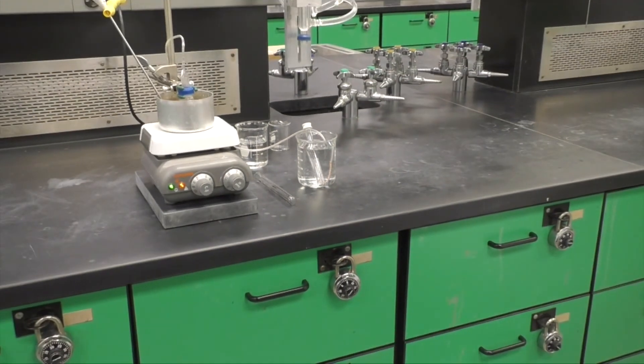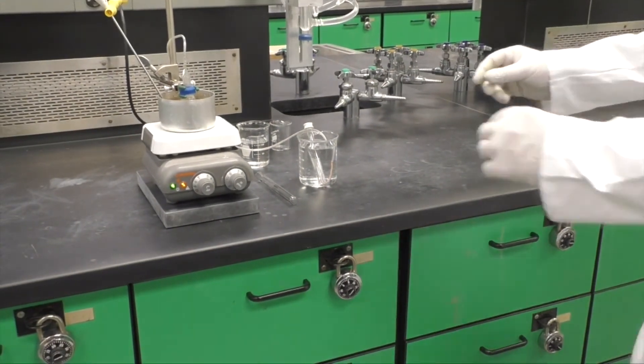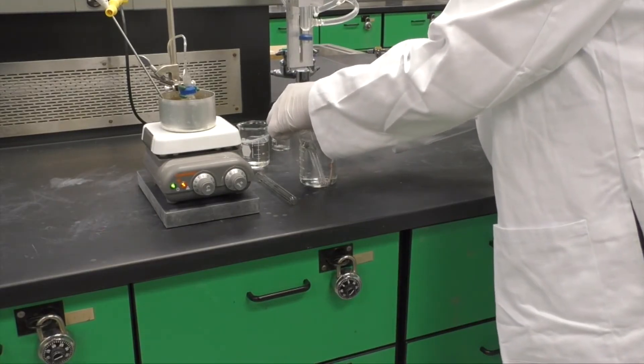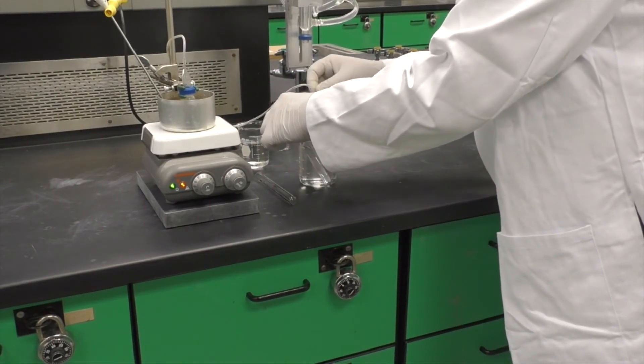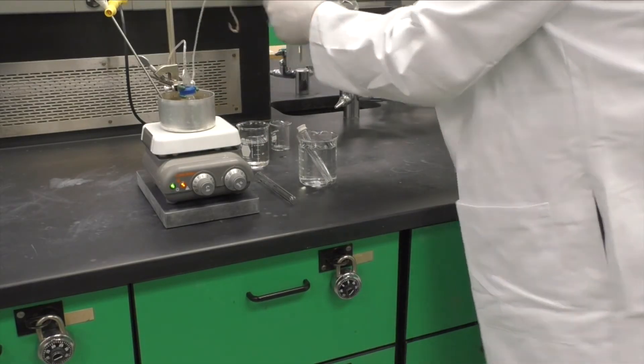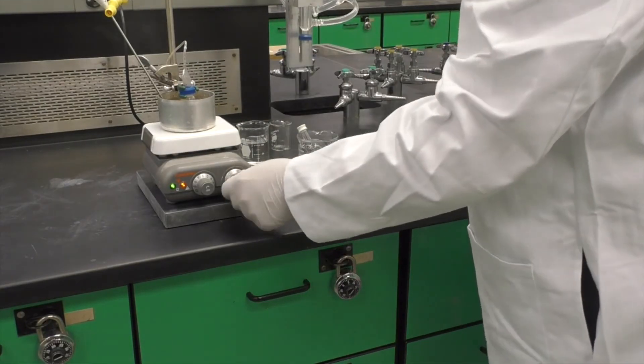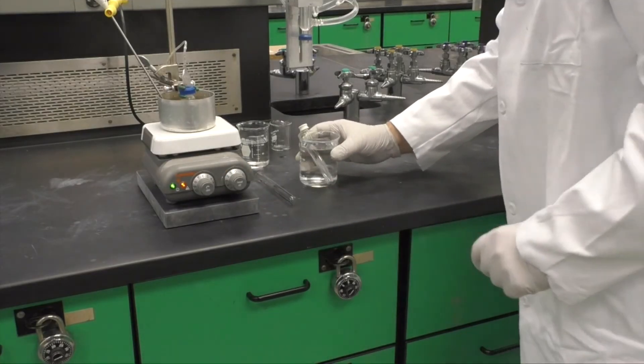Carefully lift the gas collection tube just high enough to remove the Tygon tubing before turning off the heating and stirring. If you stop the reaction before removing the tubing, water will rush into the gas collection tube and you'll have no product.